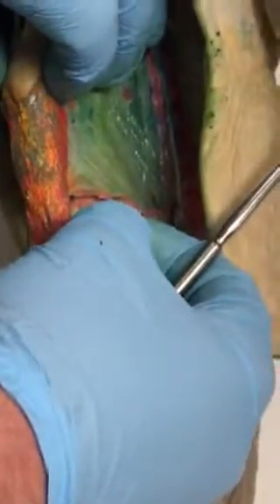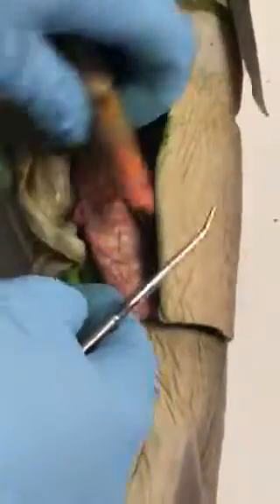The anterior mesenteric artery. That is one of these crisscross ones, the one that is attached to the mesentery. That's the anterior mesenteric, and this other one's the gastrosplenic. So where's the spleen? This little guy right here. How can you tell the difference between those two? Well, one of them is attached to the actual mesentery, and one of them is attached to the spleen.